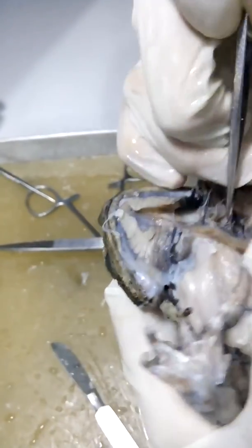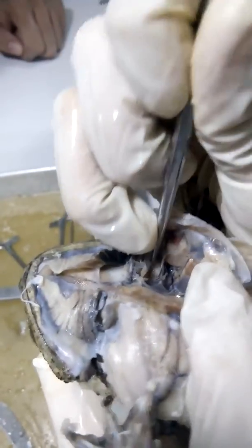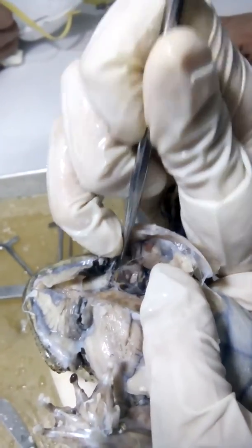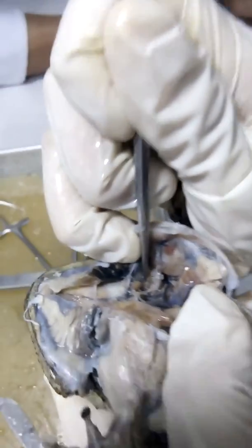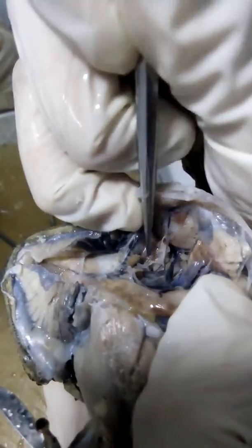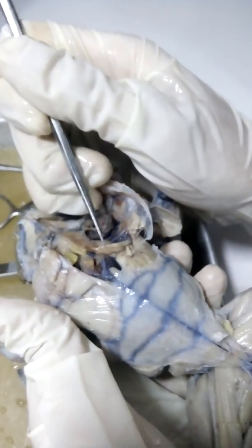Your petrohyoids are here. We can see them if hindi pa siya cut. So your petrohyoid, these 2. So I think petrohyoid superior na petrohyoid inferior. Kani sila duha.